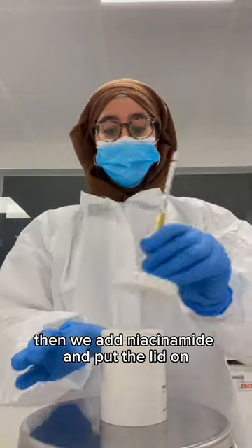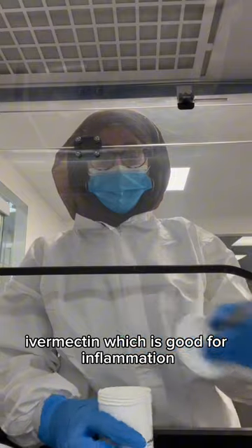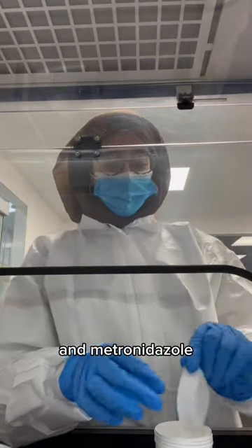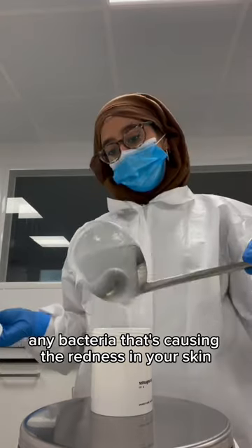Then we add niacinamide, put the lid on, and take it over to the hood. We're weighing out ivermectin, which is good for inflammation, and metronidazole, which is the antibiotic that's going to tackle any bacteria that's causing the redness in your skin.